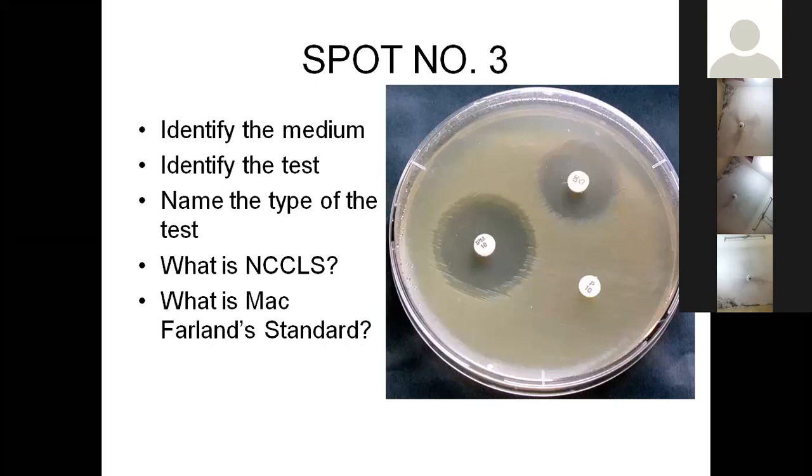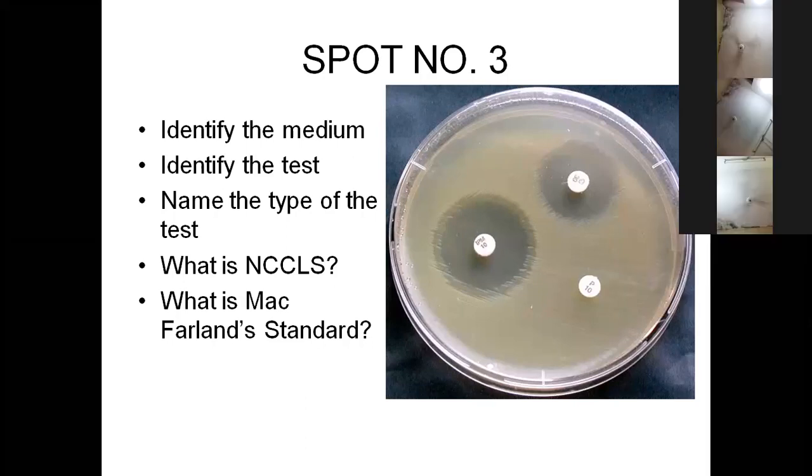This agar is going to show you growth of all bacteria, all gram positive and negative bacteria, but you cannot differentiate between the bacteria regarding their specific characteristics. For example, hemolysis or lactose fermentation or any other character. So this is a nutrient agar. This is the basic agar in which if we add certain other substances, we can make other agars.